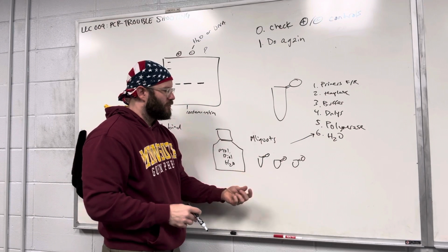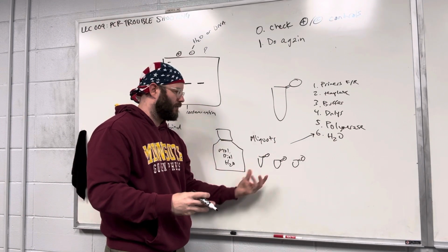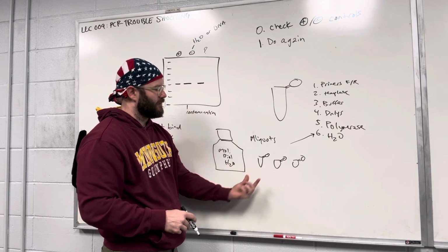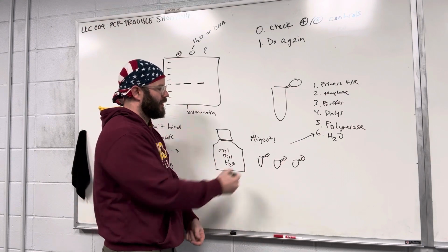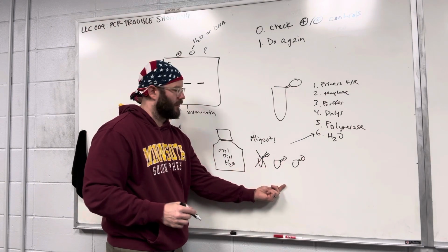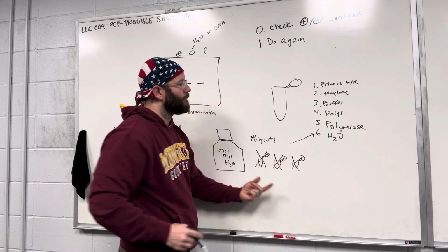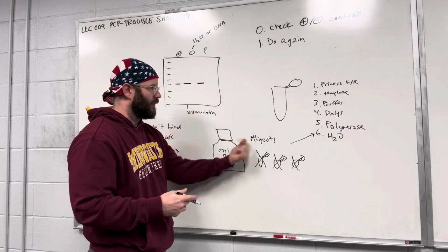After you've used an aliquot a few times, the reason it's an aliquot is because you should just throw it away. After you've used this reagent enough times to the point where you worry it might be contaminated, you should throw that away and go to the next one. Use that for a little bit, throw that away and go to the next one, and so on. So aliquoting is an important scientific practice.